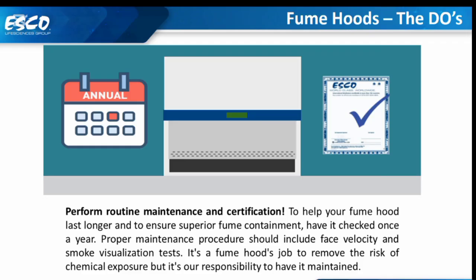Perform routine maintenance and certification to help your fume hood last longer and to ensure superior fume containment. Have it checked once a year. Proper maintenance procedures should include face velocity and smoke visualization tests. It's a fume hood's job to remove the risk of chemical exposure, but it's our responsibility to have it maintained.